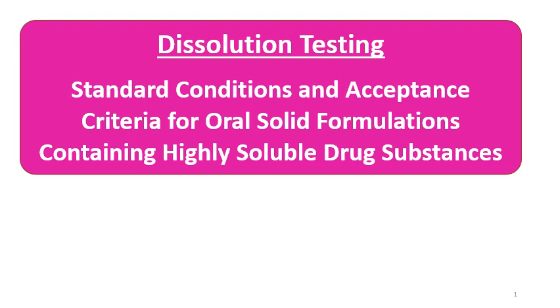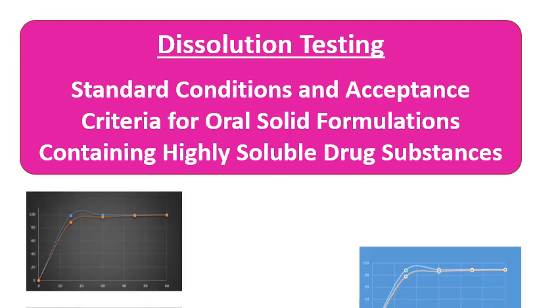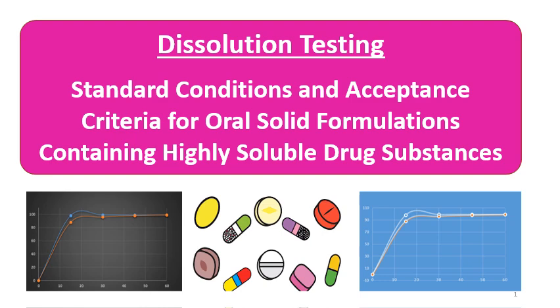Hello and welcome, dear learners, professionals, and students, to the interesting topic on dissolution. That is, dissolution testing, the standard conditions and acceptance criteria for oral solid formulations containing highly soluble drug substances. The topic name is a little bit lengthy, but the video will be very interesting.